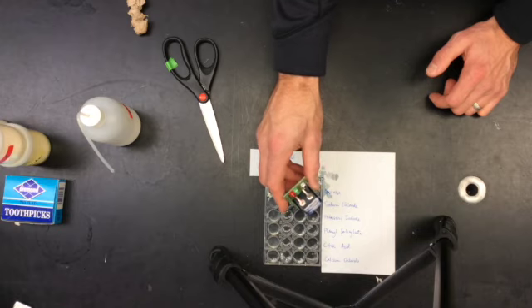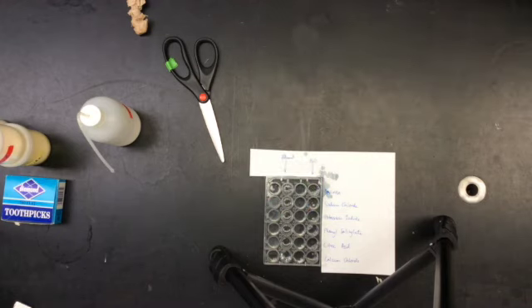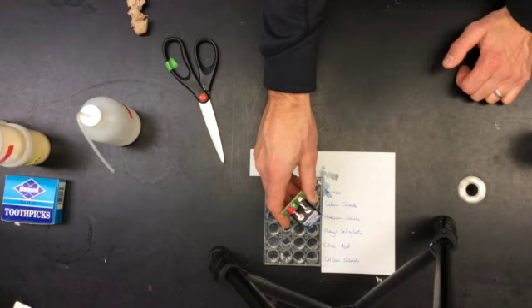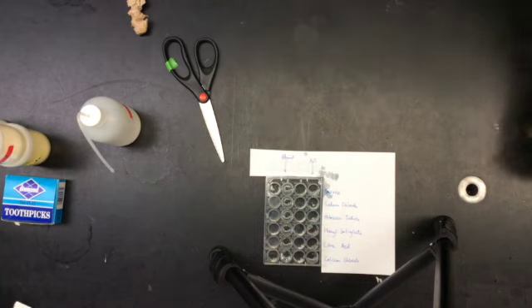Let's see, we get light turn on there, indicating that it's conducting electricity. Okay, let's try the potassium iodide solution. Again, we see the light turn on. Great.